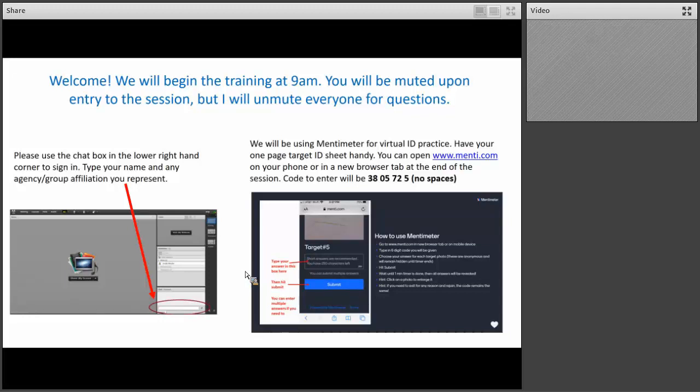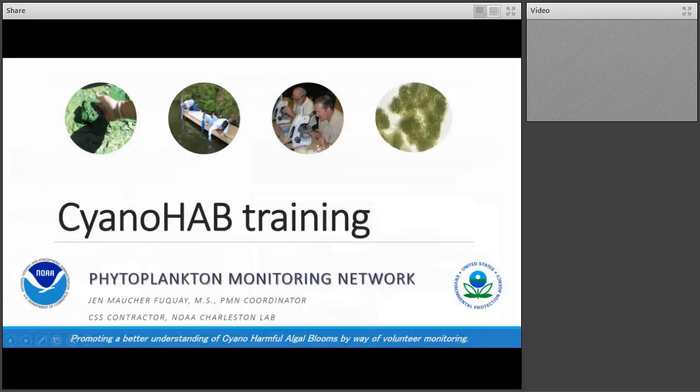Okay, so welcome to freshwater cyanoHAB monitoring training for the Phytoplankton Monitoring Network. What we're going to be doing is going through a bit of the background of the program, some background information on harmful algal blooms caused by cyanobacteria, why we are interested in monitoring for them, and having you involved in that process, of course. And then we'll be going through what you're actually looking for under the microscope. That's kind of the important part as far as logistics and details go.